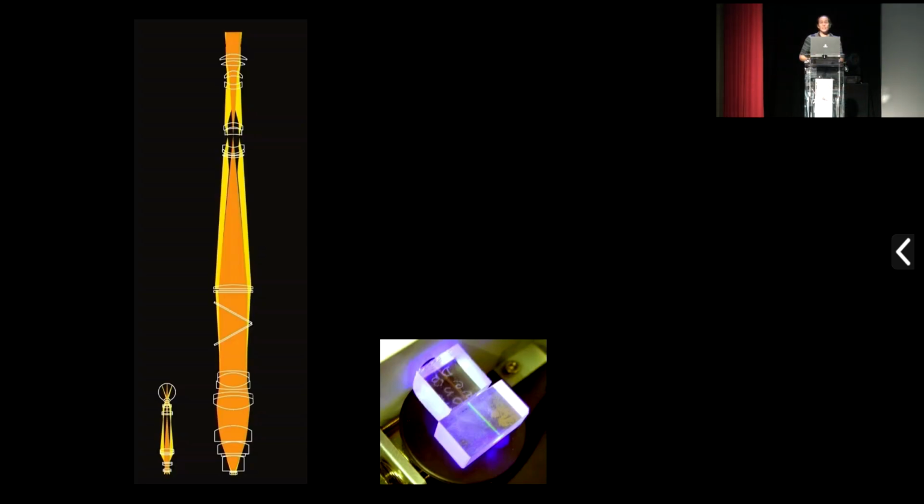Okay. Now what that means is that we can't just ship you one to your own lab. You're as well to come and use ours, or we can talk about how we can get you one. But it's not possible to bolt it onto an existing microscope, so we have to design the rest of the microscope to sit around it.